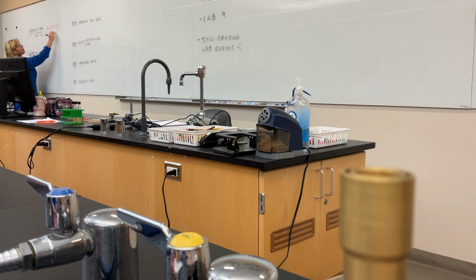Target organisms could be pathogens, but they could also be a particular organism we're looking for in the environment. If we're looking for organisms that feed off of petroleum, we could design media that has petroleum elements inside of it. Usually these are pathogens when we're talking about clinical use, but they don't necessarily have to be, all right? So usually they're pathogens for our use.